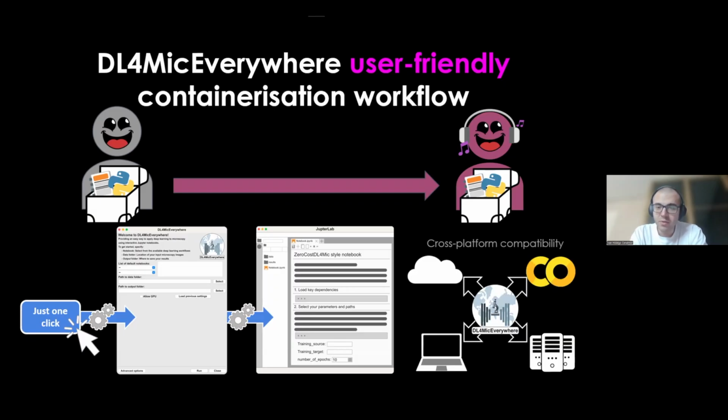And additionally, we have made Deep Learning for Mic Everywhere cross-platform compatible so that you can run it locally, here for example, as I will run now on my laptop, but you can run it in Azure in a cloud computing system, or if you have a nice workstation in your facility with some GPU, you are also able to benefit from that. And you can still remain running it in Google Colab.